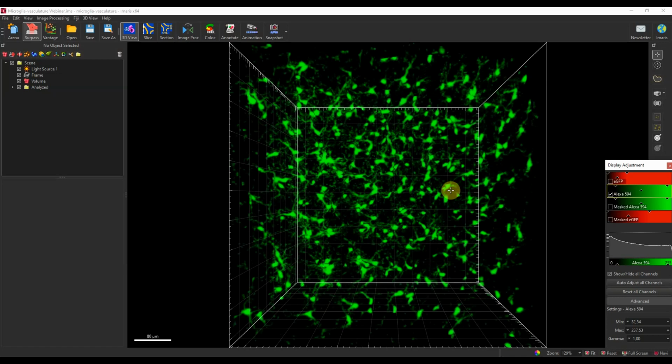An unactivated microglia would appear more ramified, whereas the activated or reactive microglia would have much fewer projections and a larger cell body, like this one here. The non-activated microglia are ramified because they extend their projections to scout the milieu for different pathogens.